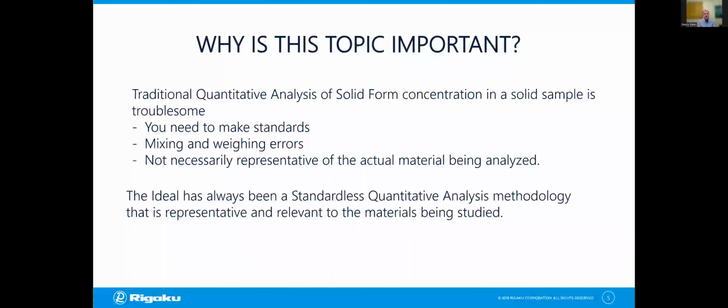So why is this important? Why do you even want to know about component analysis? Well, if any of you have ever tried to perform traditional quantitative analysis of solid form mixtures, you realize that it's not that easy. In fact, it's quite tricky. And for me, the most difficult part is that you have to make standards. And then there's all the mixing and weighing errors and the challenges of making standards. And then if you have to make a limit test sample, making something at very low levels is extraordinarily challenging.